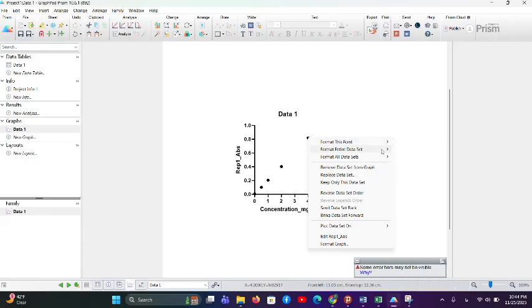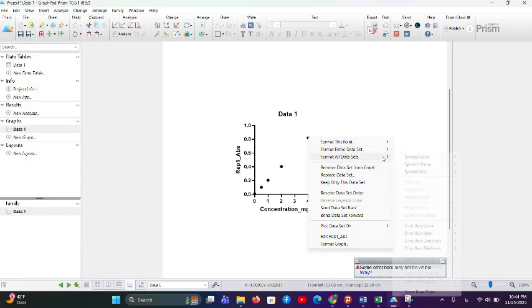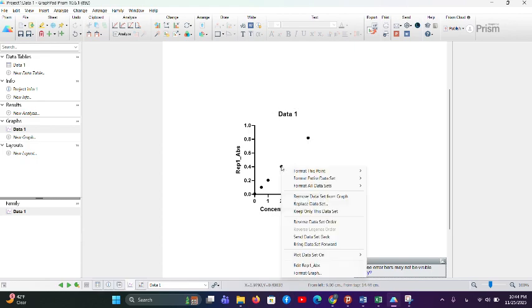You can actually change the color of line curve and choose a kind of special pattern for that, and bring some data sets forward, or send some data sets back. So these kind of options will be really useful for some kind of complicated measurements that you have a lot of data. But here for a simple calibration curve, we might not really use them that much.